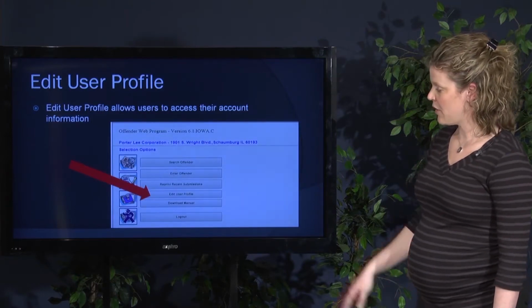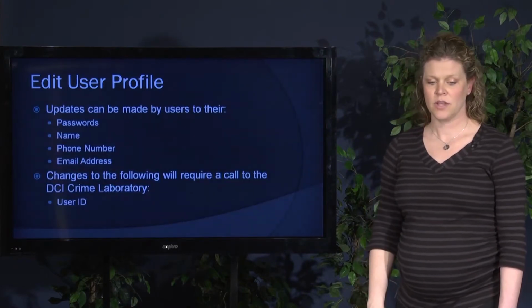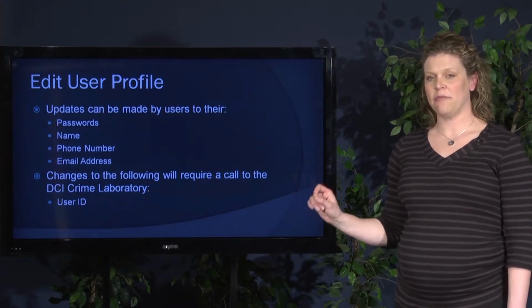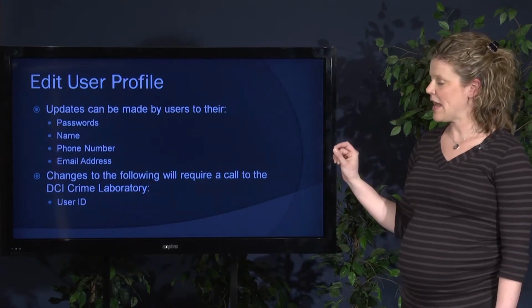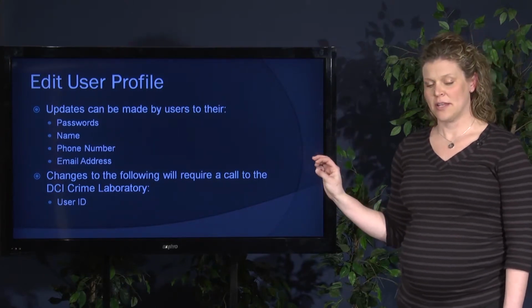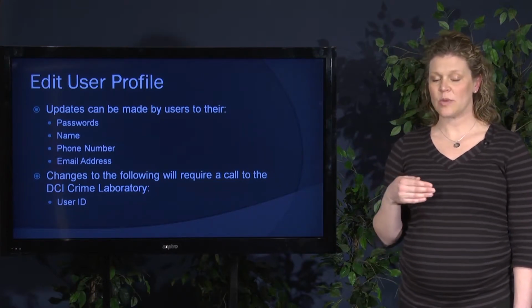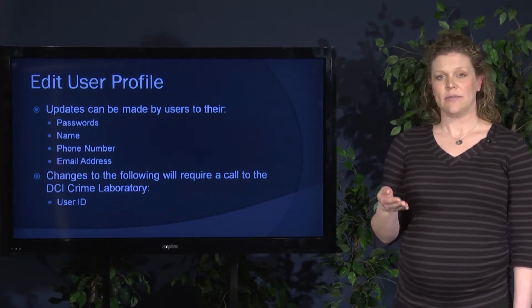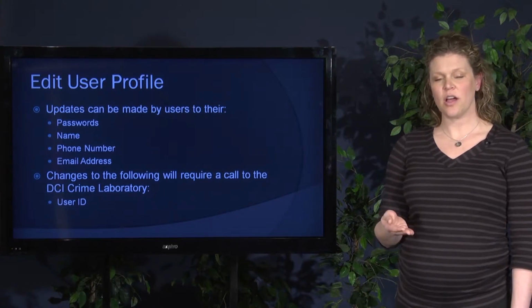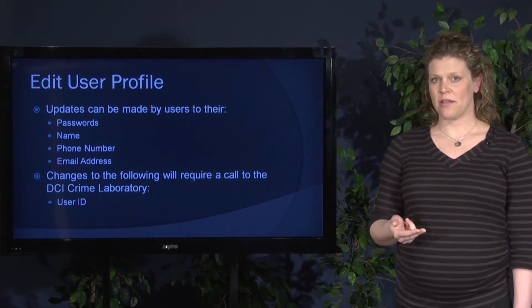All right, another option here is Edit User Profile. Updates in this particular form can be made to the password, your name, your phone number, and your email address. We ask that when we activate this website and send it out to you as a user, this website is ready to go, that you come in here and update your name, your phone number, and your email address.